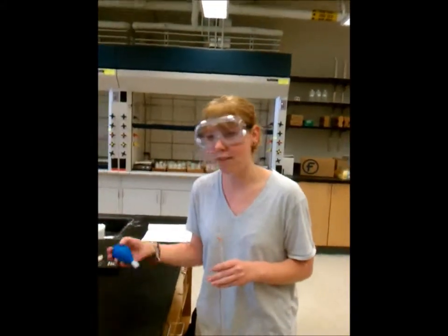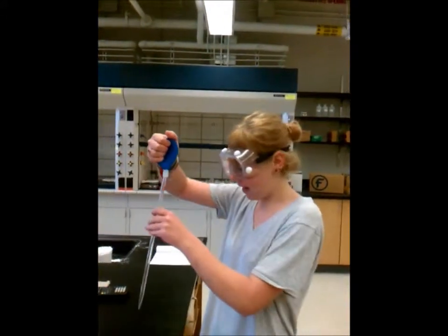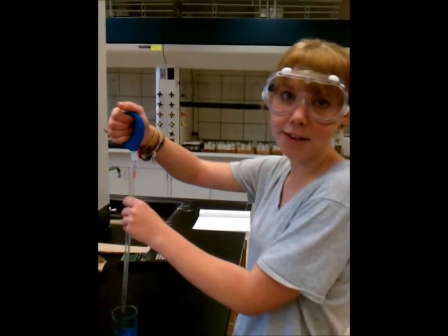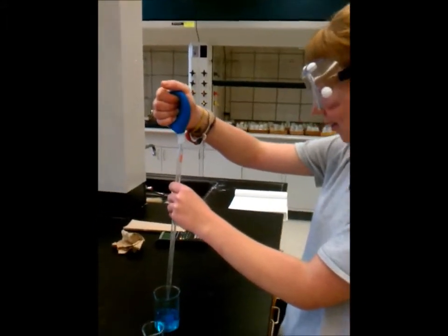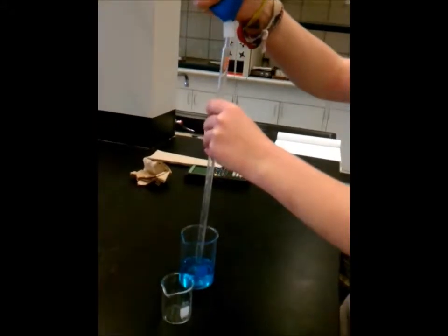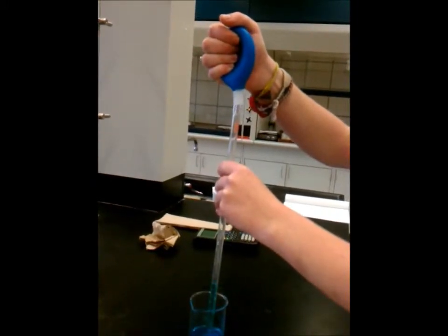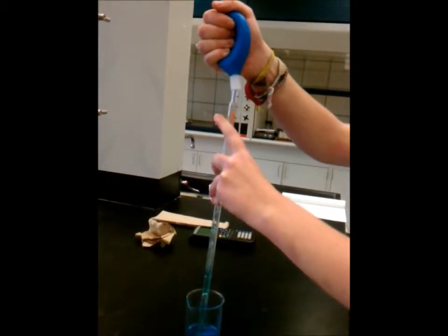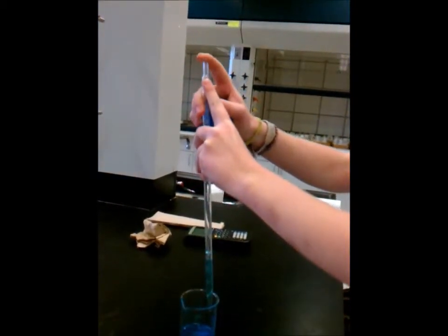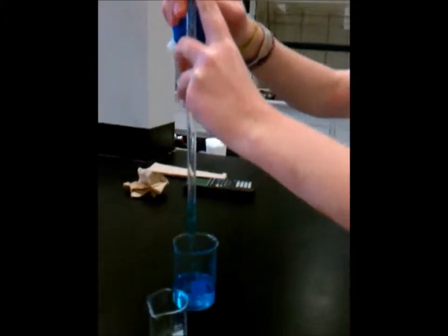In order to do that, you have to squeeze the bulb, and then you place it on top of the pipette. You stick it in a beaker for your solution, and you want to make sure it doesn't touch the bottom. And then you put it in the water and release the bulb until a certain point. Alright. This time I got a little bit of air, so I'm going to do it again.